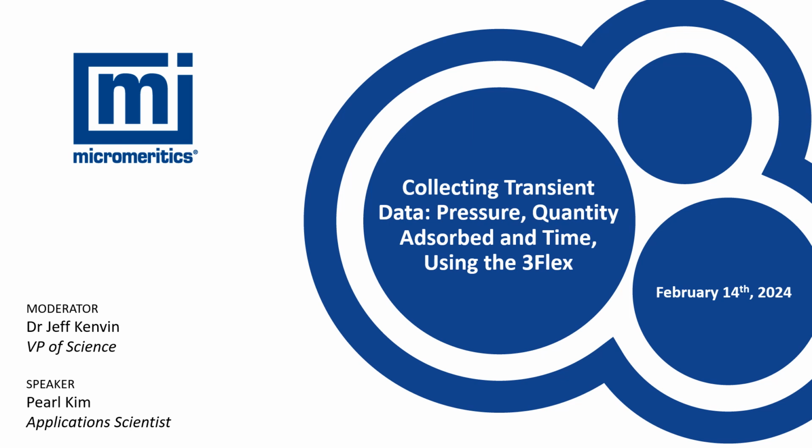I will talk about how to collect the transient data on the 3Flex today, and the main purpose of this webinar is to inform our users how to effectively collect the transient data on the 3Flex, since the number of requests that were received for this piece of information has increased significantly in recent years.